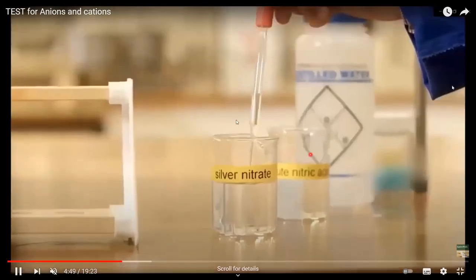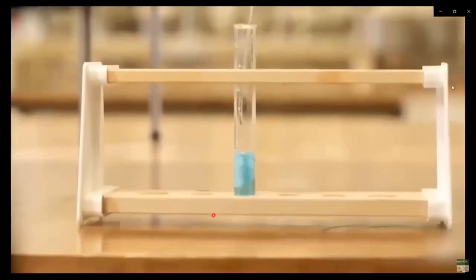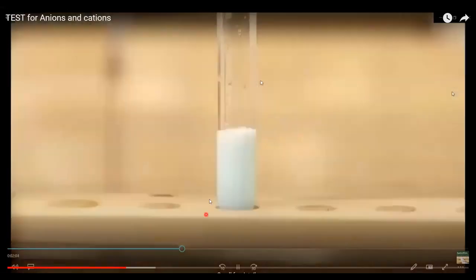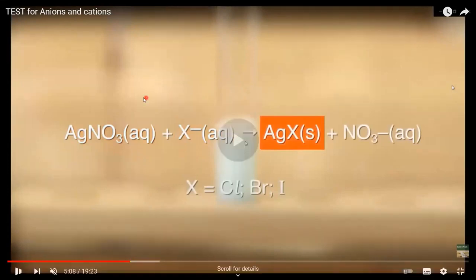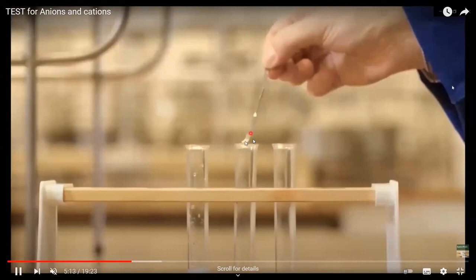So when we add silver nitrate solution, two solutions are there. But when we add this, you can clearly see a white precipitate. So if there is a white precipitate, this gives an idea that this salt is a chloride salt. Because the chloride ion takes the position of the nitrate. So this gives a white precipitate.